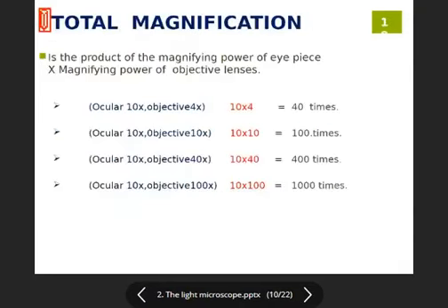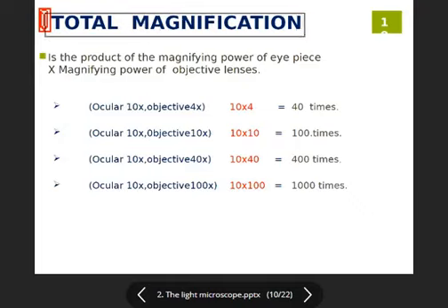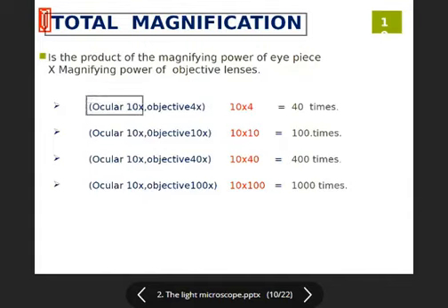But if you talk about total magnification power, yani there are two things: magnification power and total magnification, quwwa takbir ajmali. So how do you calculate total magnification power? You multiply the magnification of the ocular lens and the magnification of the objective lens.